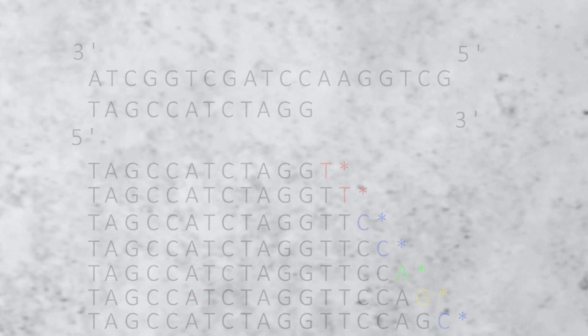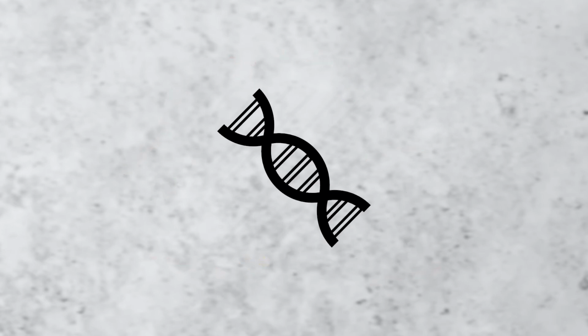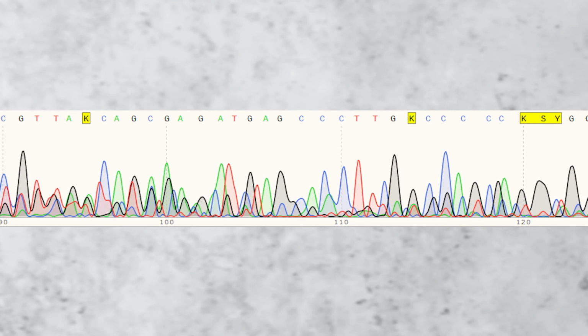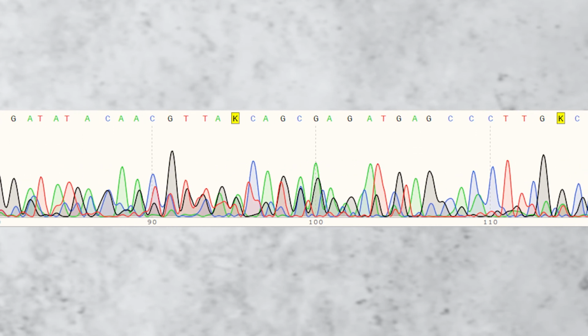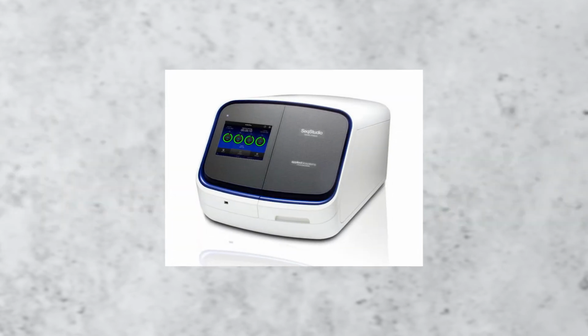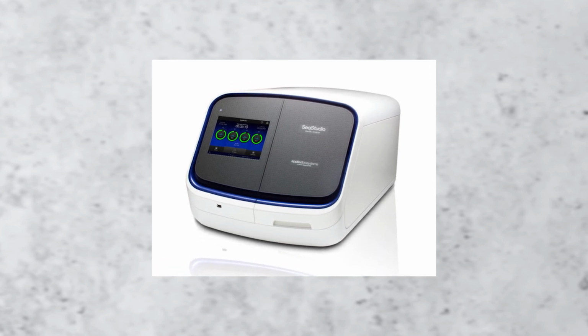Following the PCR reaction, the DNA is not visualized on a polyacrylamide gel. Rather, the DNA is purified in a second cleanup step. This step is imperative since it removes all excess ddNTPs. Since the sequencing machine measures fluorescence, excess fluorescence and unnecessary fluorescence will influence the sequencing results. The sad truth is that all a Sanger sequencer does is measure the fluorescence of nucleotides to determine the sequence.